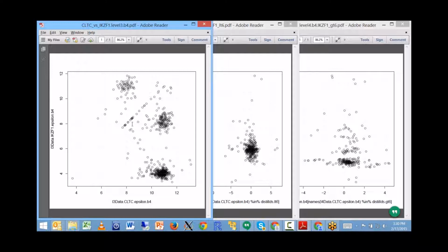And then on the x-axis are the ones that could not be separated, samples where it cannot find two different clusters. So this picture is fairly typical of pairs of genes that have similar expression level, or any pairs of genes that were measured on the same bead. That would be my hypothesis, that basically these are all expression levels related to CLTC, and these are the ones where we actually measure both of these genes, and then they are well separated and everything is fine.